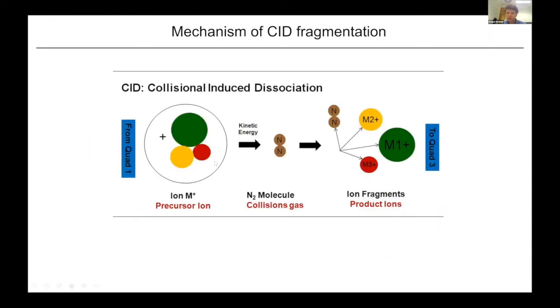Now, what I wanted to show you is the ability of mass spectrometers to not just look at intact peptide masses, as shown on the previous slide, but also to actually sequence peptides and obtain fragmentation spectra. And the example shown here is MS fragmentation, or collision induced dissociation, CID, as can be performed, for example, in a triple quadrupole mass spectrometer.